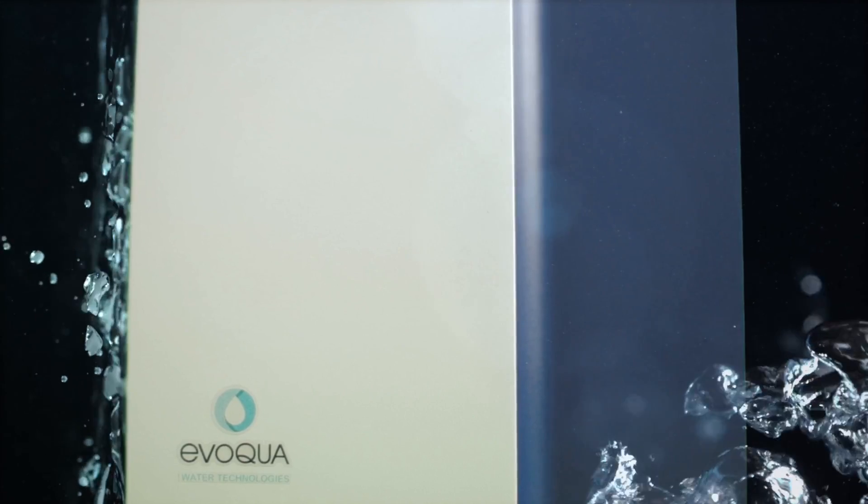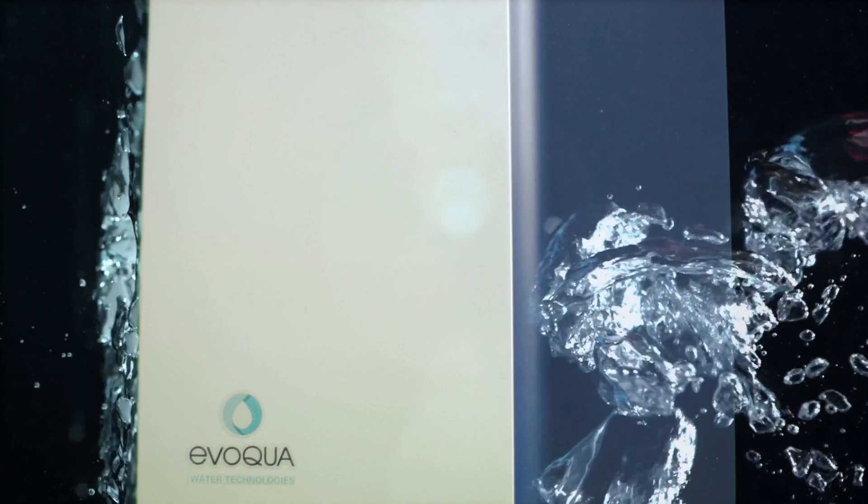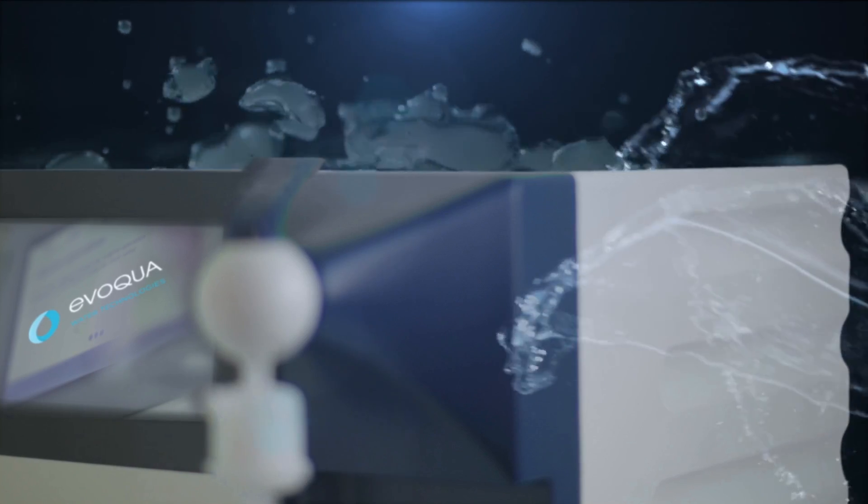Engineers singularized one technology over the past centuries and harvested what they always wanted. Purified water for enriched life.